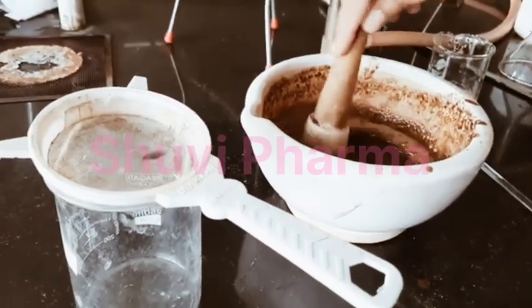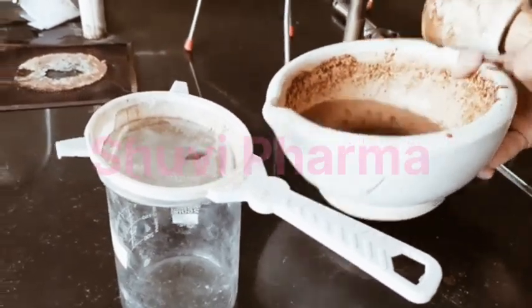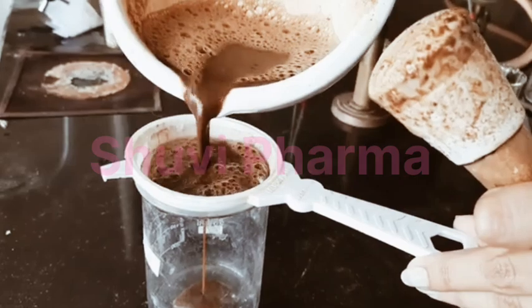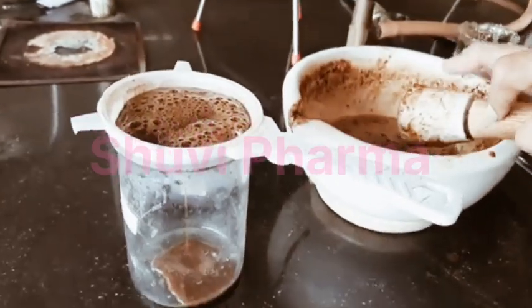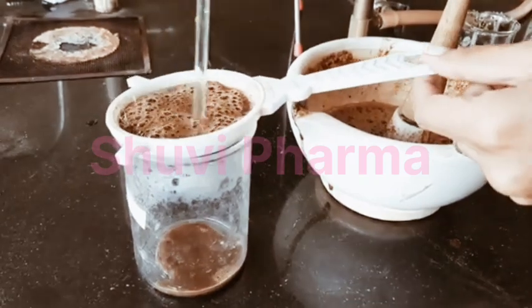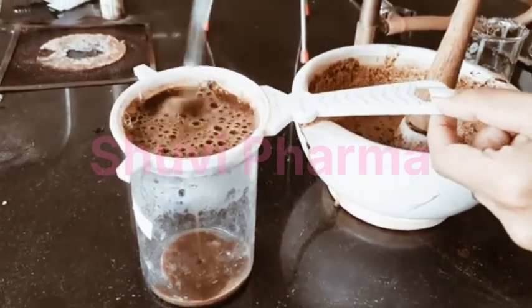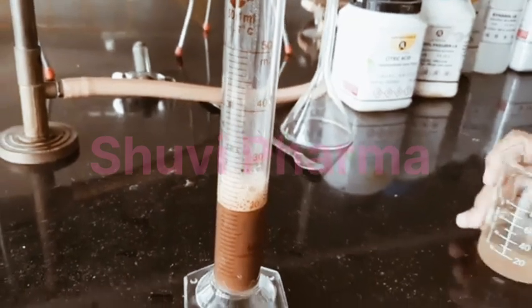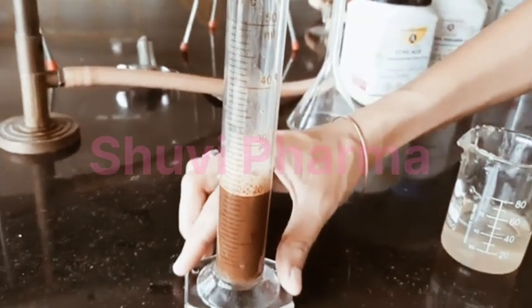Now we will filter this. So firstly we will filter this by using sieve. So this is the extract which we have filtered.